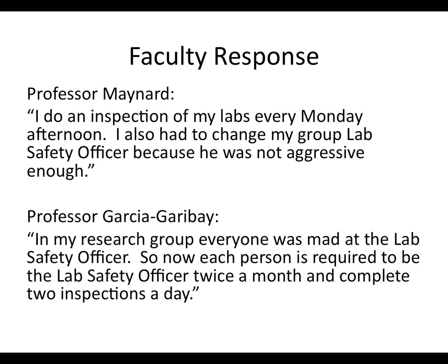Professor Garcia-Garibay solved that last problem in a different way. He said, in my research group, everyone was mad at the lab safety officer because apparently that person was being too aggressive. So what Professor Garcia-Garibay did was each person in the lab group is required to be the lab safety officer twice a month, and for those 2 days, complete 2 inspections a day. This spreads out the responsibilities among the students so that they all get to be the safety monitors for the lab.